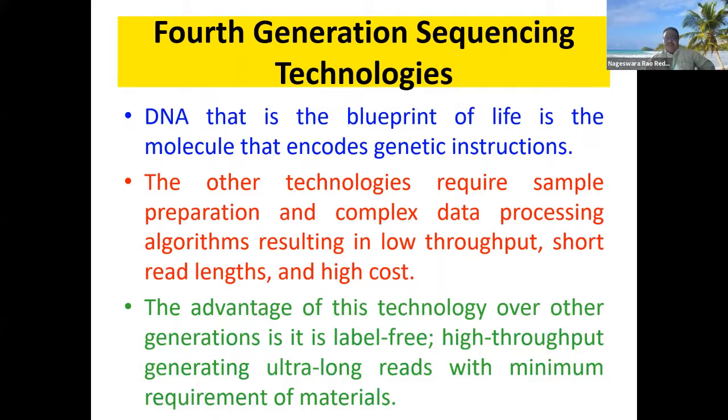Okay, so what has made this fourth generation easy? Preparation of the sample is very easy. Data processing is very easy. Complicated algorithms are not there. It's low in cost, and it is generating higher output.